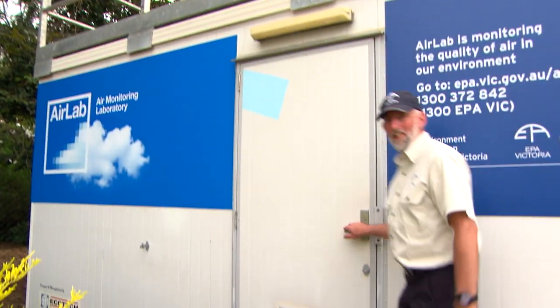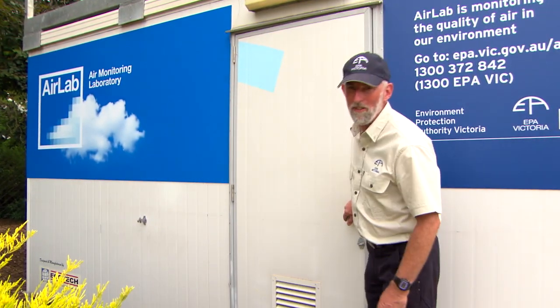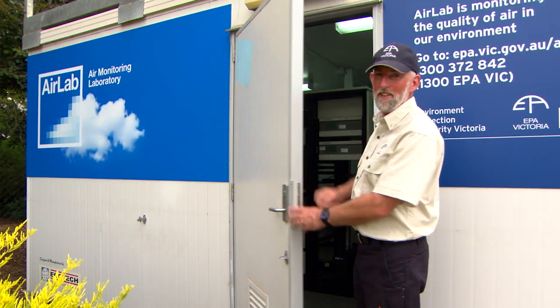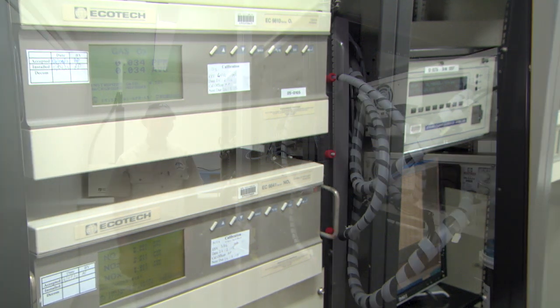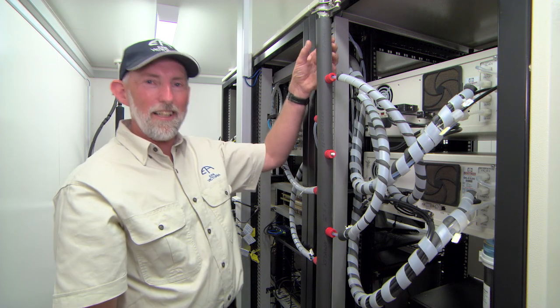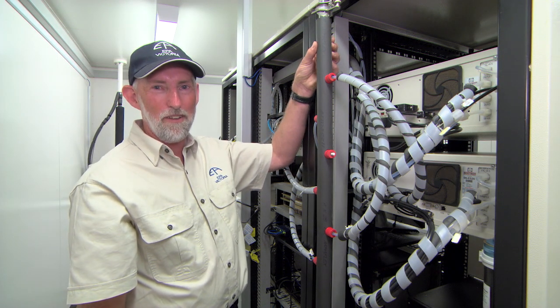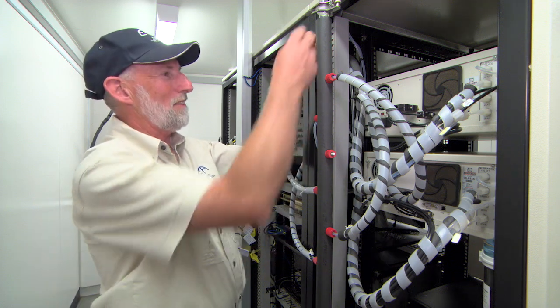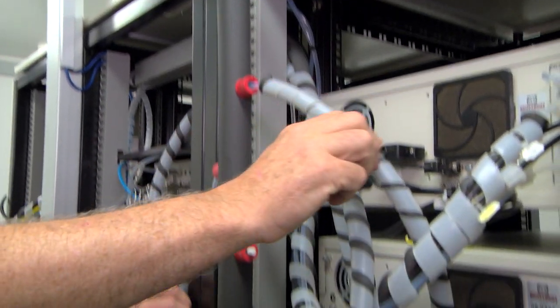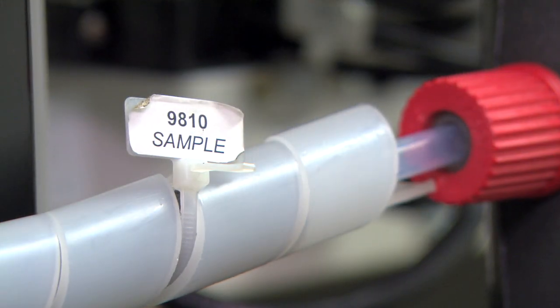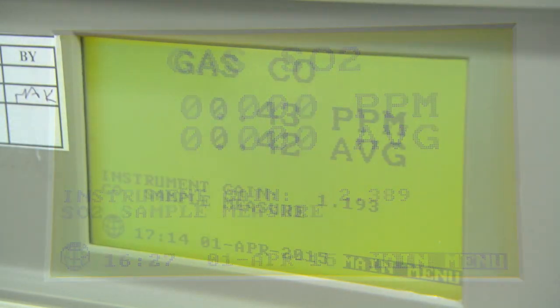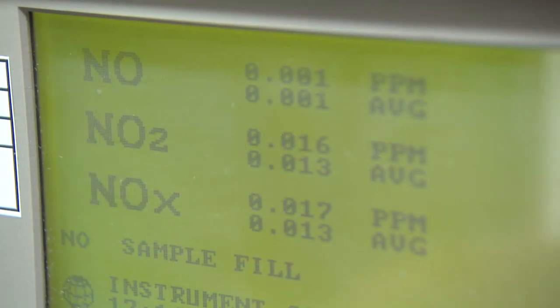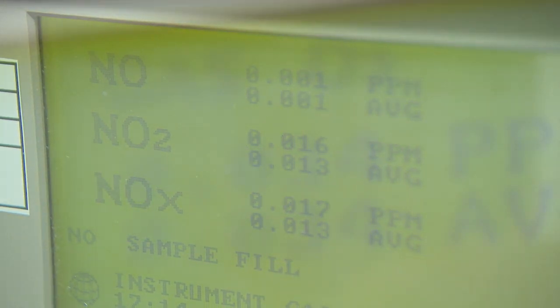I'm going to take you into the station now. It can be a bit noisy because the equipment has to run 24 hours a day. This is connected to the glass inlet we saw on the roof. An air sample travels down and is distributed to the various analysers. Each one of these measures a particular gas: sulfur dioxide, carbon monoxide, nitrogen dioxide and ozone.